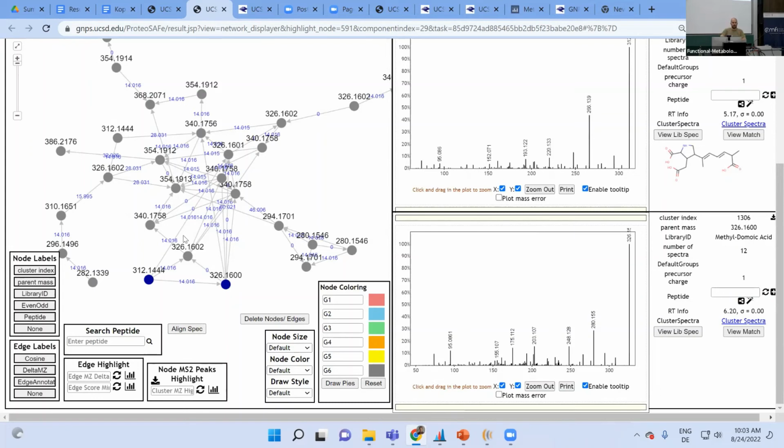And now with my chemistry knowledge of this molecule, I can already propose a new structure. Like I did with albicidins, what I showed you, I think on Monday, right? I knew the biosynthesis pathway of it, and I knew what potential amino acids could be in there, and what tailoring enzymes might modify that. So I can just from that knowledge propose structures.